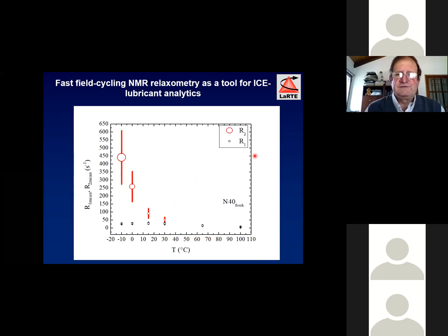Okay, this is the same result as before, but now for the lubricant. So again, we have sensitivity in T2 as a function of temperature, but not in T1.